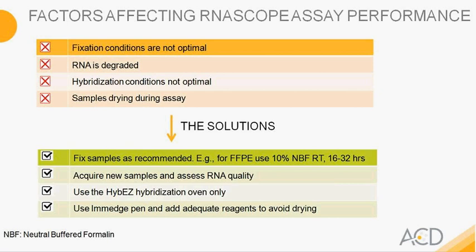While we do not know why the ImmEdge pen works well with our assay, we know that we validated other hydrophobic barrier pens and found that sometimes they lift off during the assay. The ImmEdge pen is the only hydrophobic barrier pen that has been shown to sustain throughout the assay. We therefore highly recommend that you only use the ImmEdge pen during the RNAscope assay.